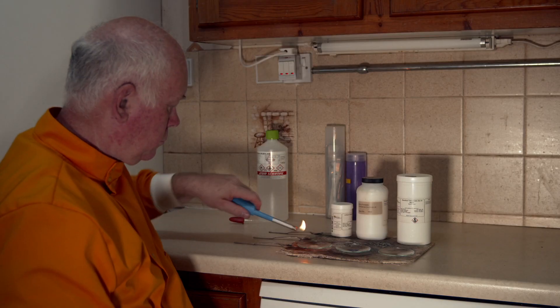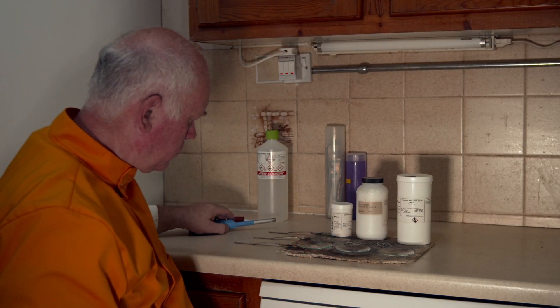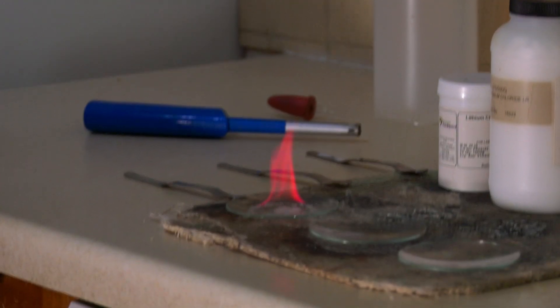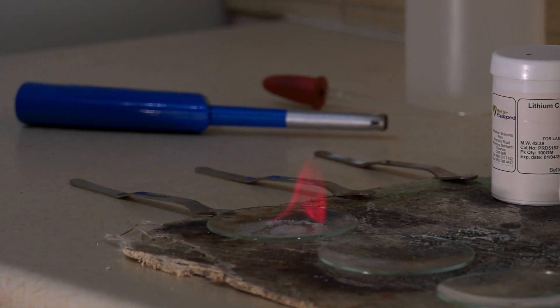We'll try and make it a bit clearer for you by turning out the lights, so that we can just look at the flame. And there, you can probably see the flame of the lithium much clearer — this crimson red colour.